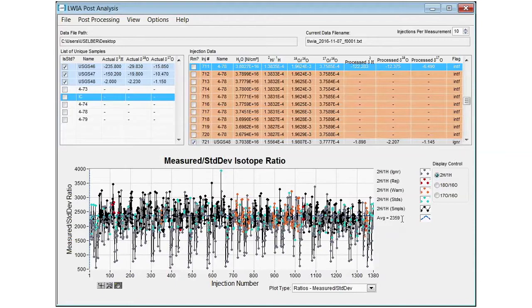If you are finding that your values are consistently lower than that shown in the manual, we encourage you to contact service@lgrinc.com to take a look at those.